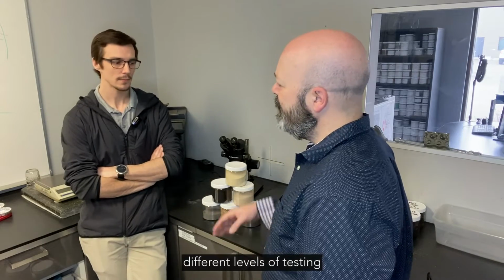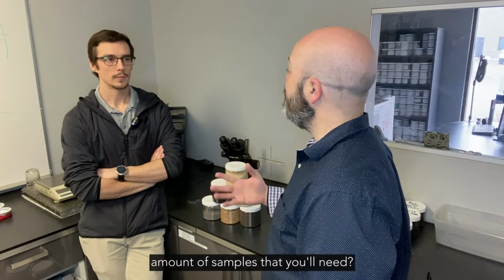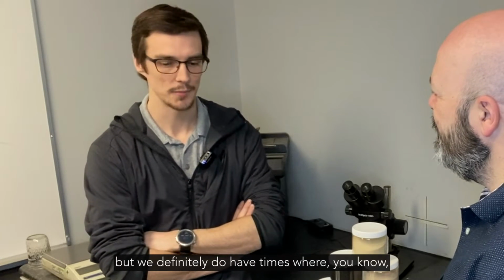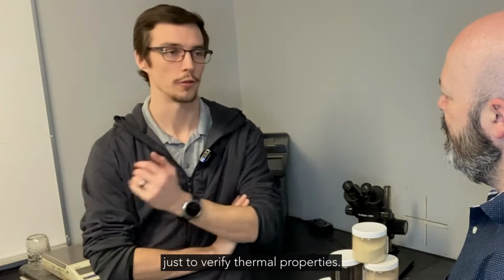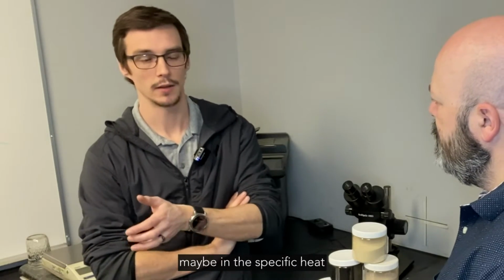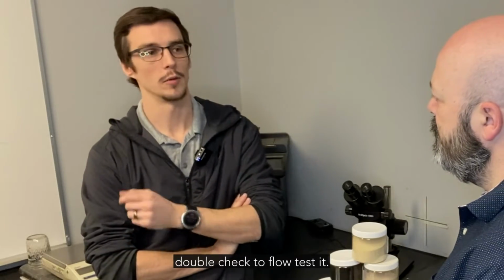Yeah. Now, are there different levels of testing that will require different amounts of samples that you'll need? Certainly. We don't have a really formal chart and say ABC, but we definitely do have times where we might just need a couple liters of sample just to verify thermal properties. Maybe we're very confident in the flowability or we've done something similar, but the uncertainty is maybe in the specific heat capacity or something along those lines. Sometimes it's just a quick double check to flow test it.